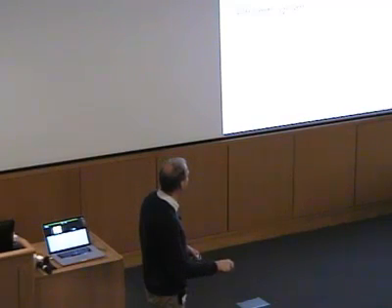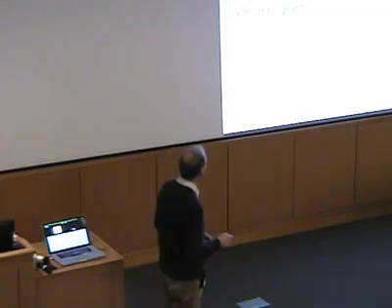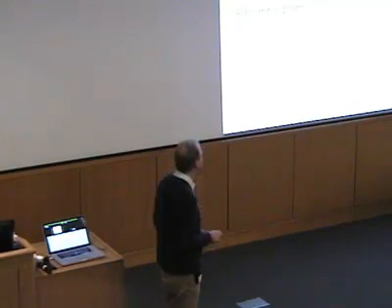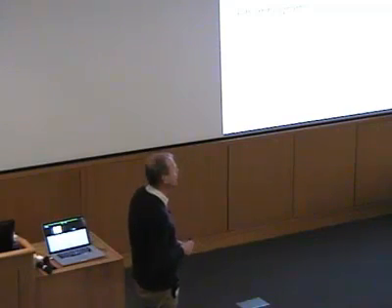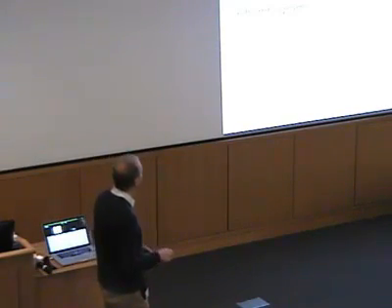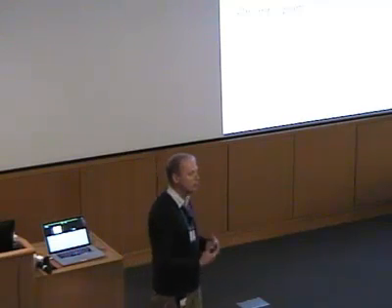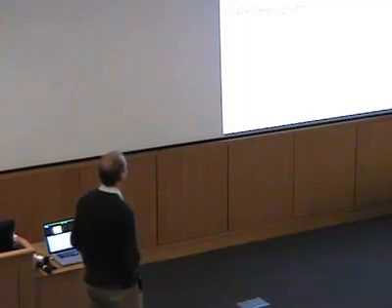I can let my value of E over D vary from 0, which would be an axial system, to 1/3, which is a purely rhombic system, and then plot the various lines that could occur in the spectrum as a function of E over D. Then, if I have a particular spectrum, I can look where I am on this graph and figure out what the rhombicity of the system is. Right? And so these diagrams are referred to as rhombograms.